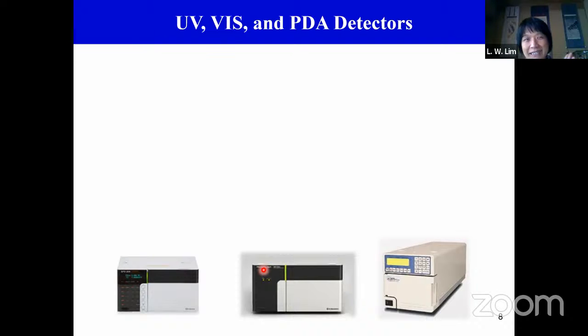When the ions are ionized, the time passing through the vacuum depends on the size of the mass. It's one of the most expensive mass specs in the world, and they managed to do so well in the structural determination of proteins and all the biological samples.